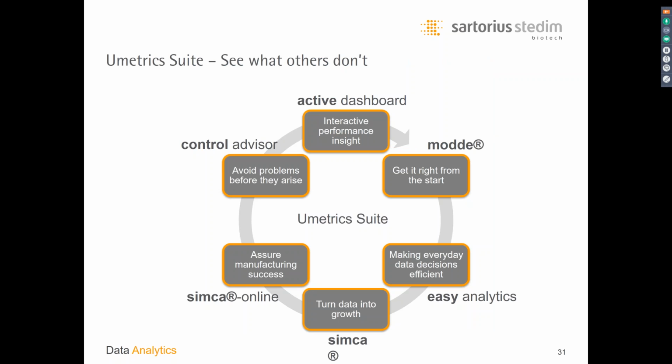And just to summarize, where this fits in is as part of the Umetrics suite. It's a pretty comprehensive suite of tools, right from design of experiments, which is to create data, all the way to making prescriptive decisions based on analytical methods and modeling and all these interesting things that I've spoken of today in many different pieces. And also, if you take in context the Sartorius offerings, it's a very comprehensive analytics, measurement, control and automation platform that we can deliver on.